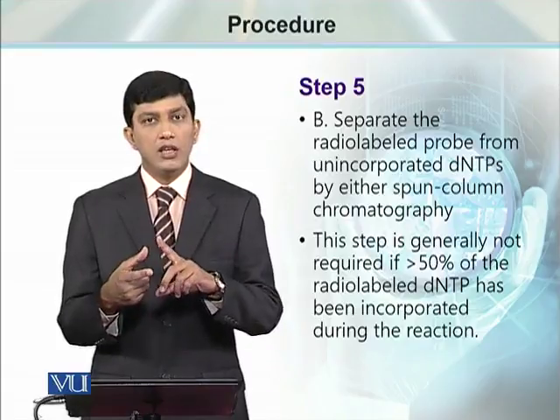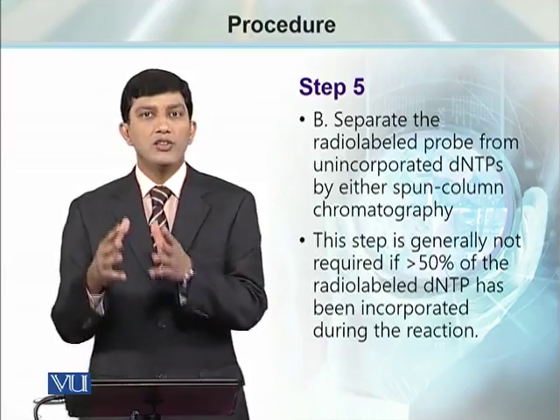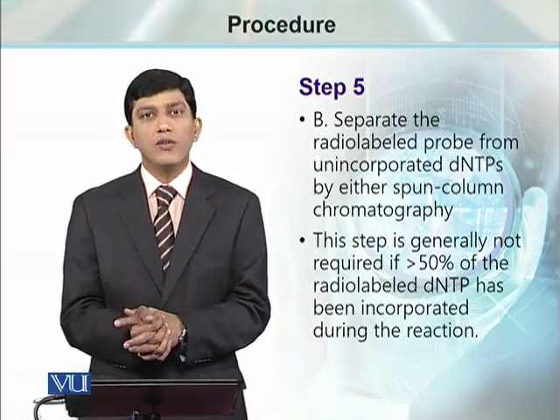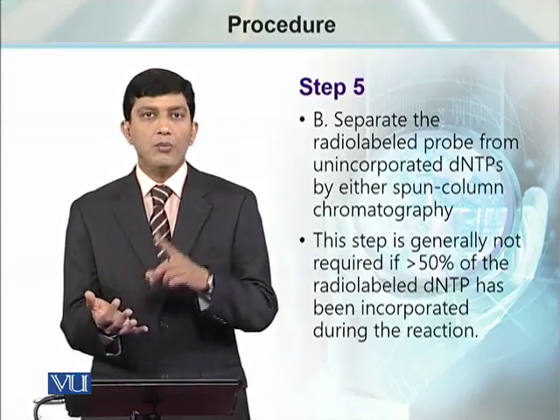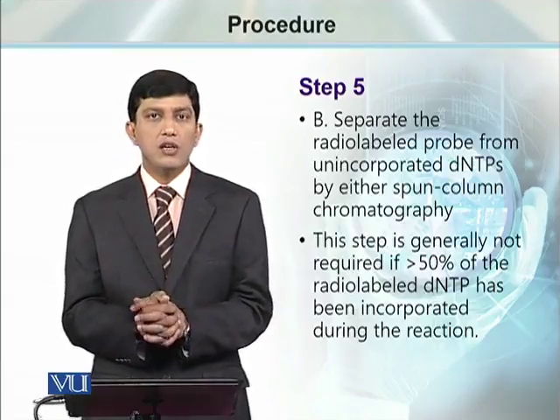Discarding the radioactive waste is also mandatory to be done in a specific container which is meant for radioactively labeled waste, whether this is a plastic tube, whether this is a pipette tip, or whether this is any liquid which is used in radioactivity.